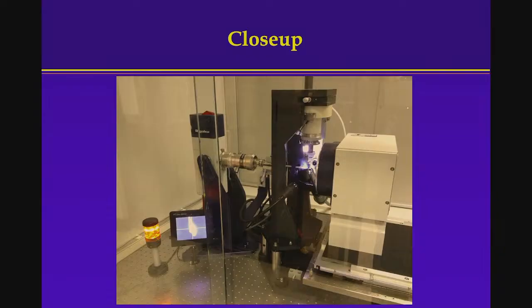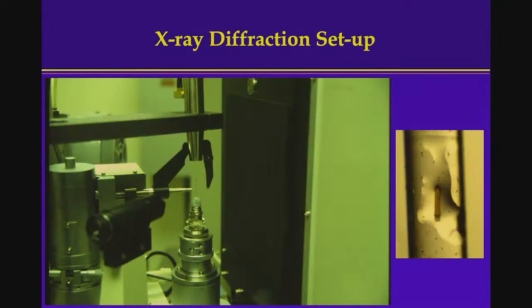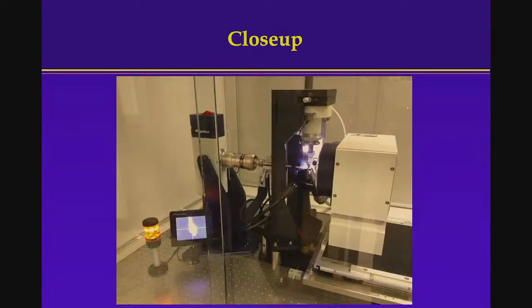And then more recently, another way of doing this is using an even smaller one. This is the one I showed you earlier, something called an imaging plate. It's a piece of X-ray film that's reusable. And this one is something called the CCD, charge coupled device. And then you can essentially record the image directly without having to scan it again.